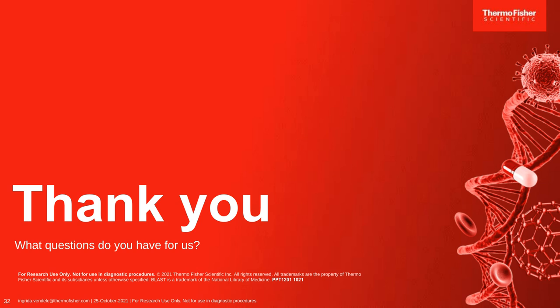Thank you. Next question. When analyzing crude samples with the Colorimetric ReadiLAMP Kit, how is the SARS-CoV-2 virus inactivated in the samples?